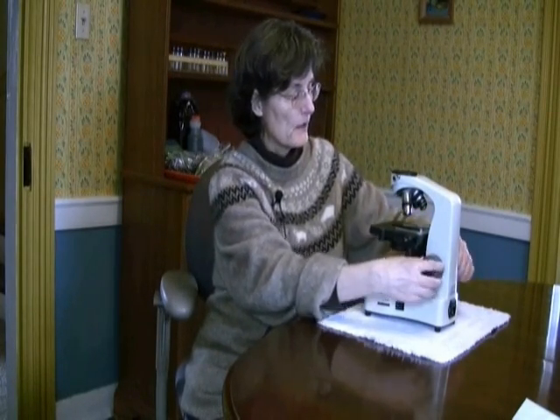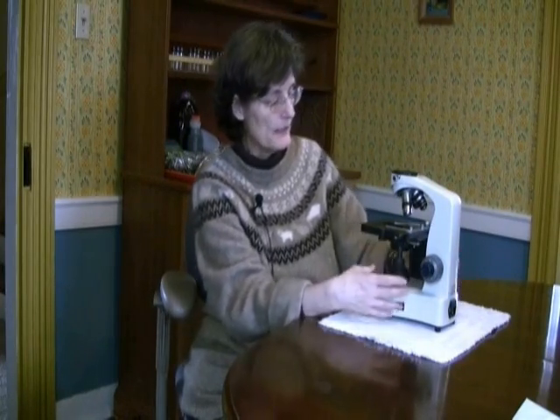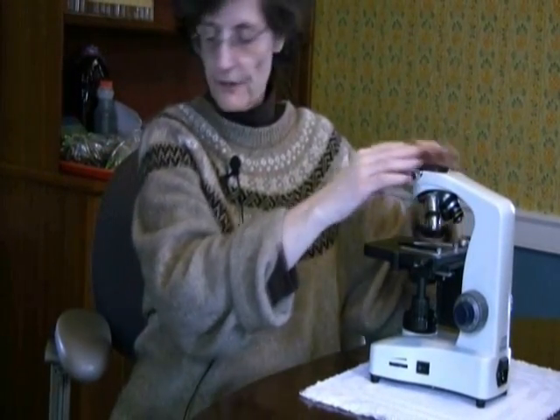We want to make sure that our stage moves up and down. We want to make certain that we have the forward and back slide holder. Makes it really easy for moving your slide around and finding things on that slide. And then we want to make sure that we have the condenser under here, and that that condenser has a focusing knob and it's definitely going up and down. This is our lamp. The lamp in the base of the microscope, the illumination comes from this point here. So the next thing to do is to get our headpiece on here.